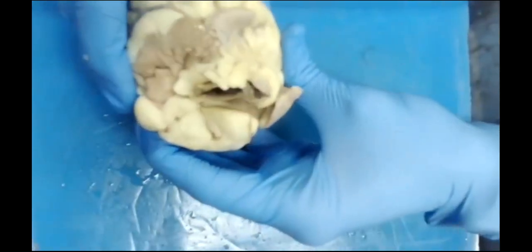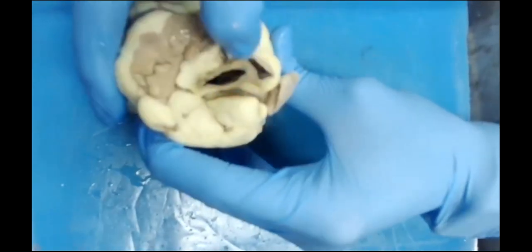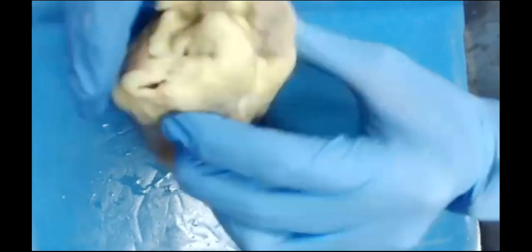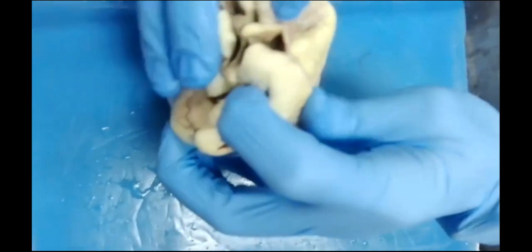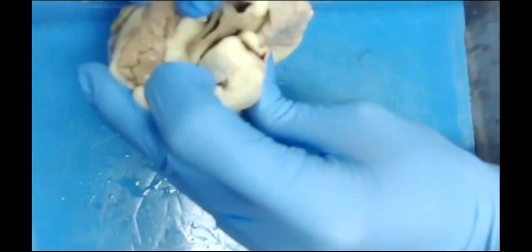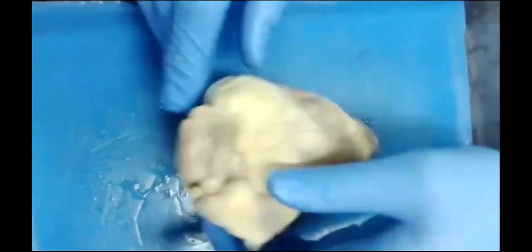We can also see at the top of the heart some of the great vessels, whether it is our aorta or our superior vena cava. So we can see some of these. Sorry, there's our superior vena cava. This is our pulmonary trunk. So here's our aorta, here's our pulmonary trunk. So let's go ahead and see if we can get this bad boy open.